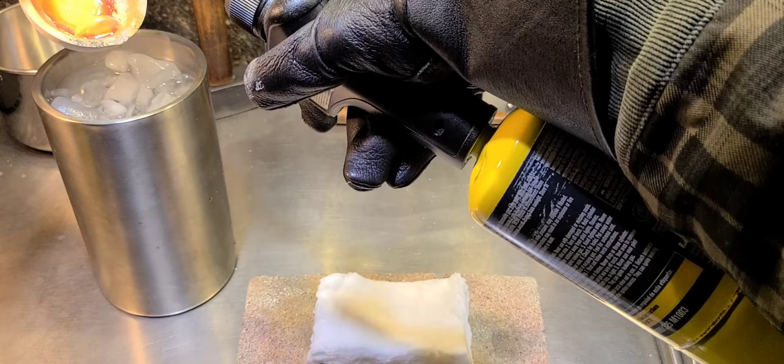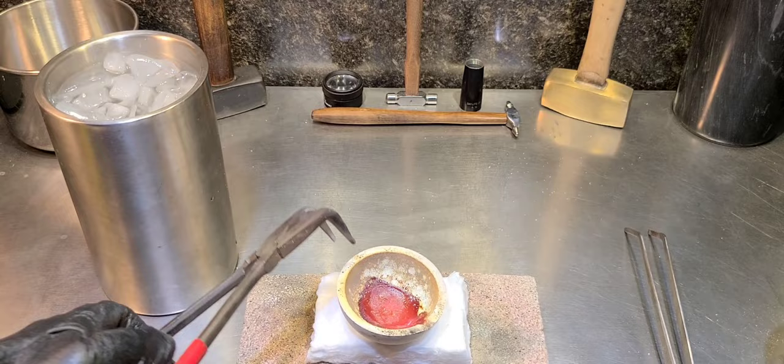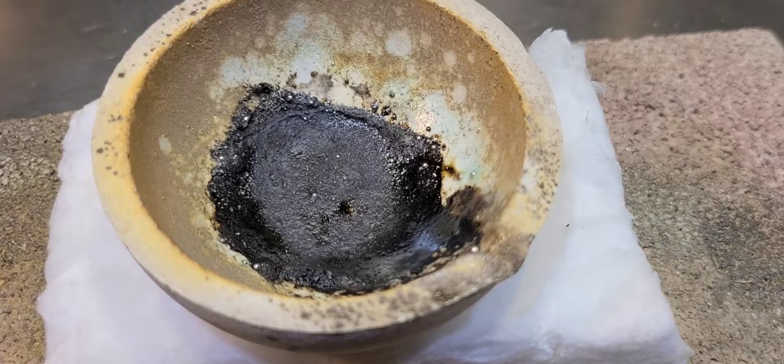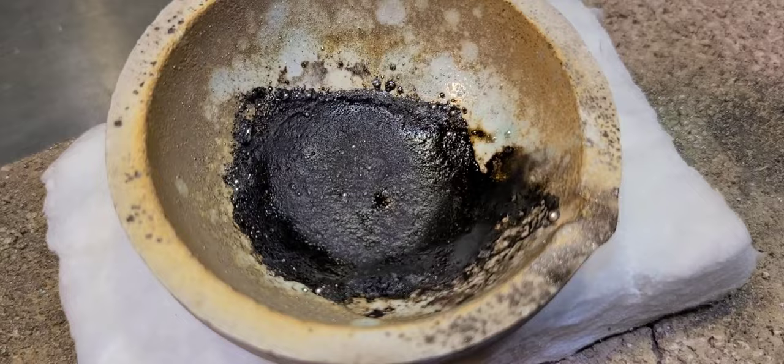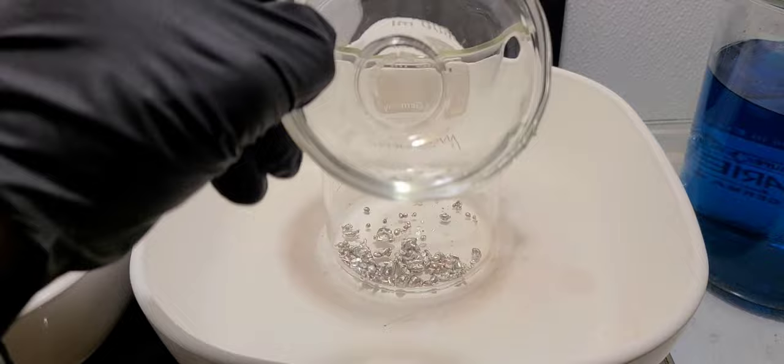So I've got it melted down. I'm going to pour it into some cold water here. Man, look at that dish — yikes. All that black gunk and slag is all the sand that turned basically into glass and clung to the glazing, to the borax that's in the dish. So all that's gone — we took a little loss there. There's our inquarted gold. Looks like silver at this point.